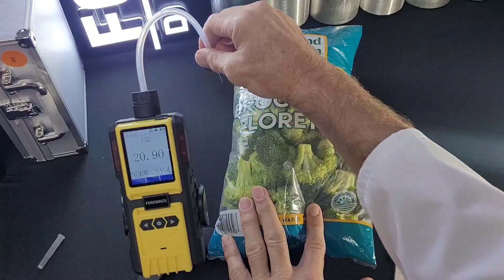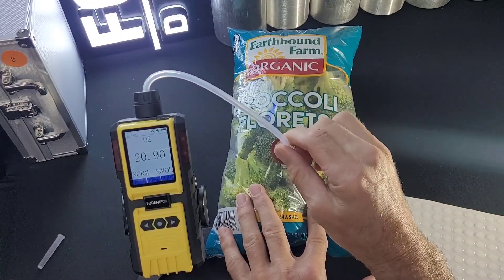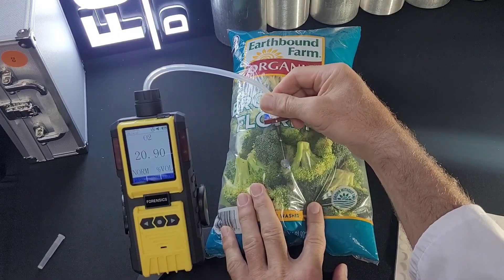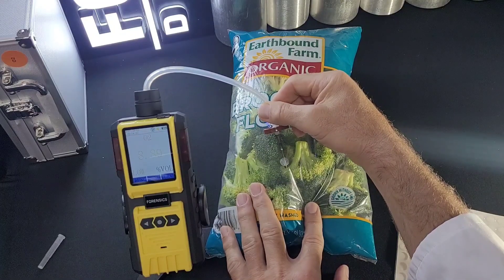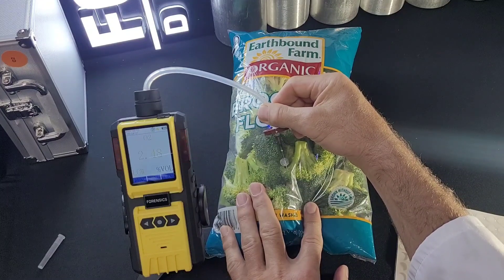Once the septum is on and dabbed down, I'm going to come in on about a 45-degree angle, just like that. I heard some resistance on the micropump as it went through the septum — that's good. Now it's reading the air in the package and it's going down.